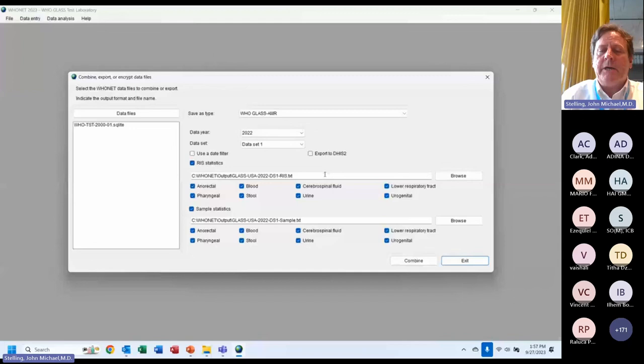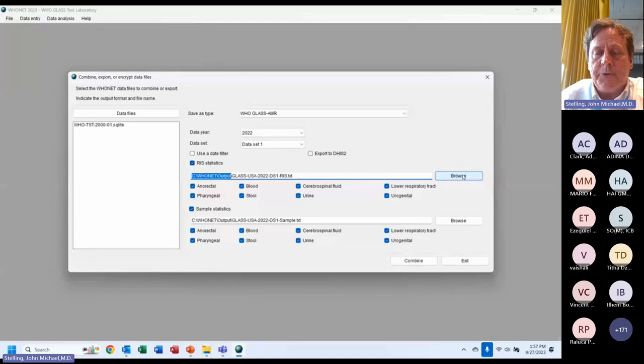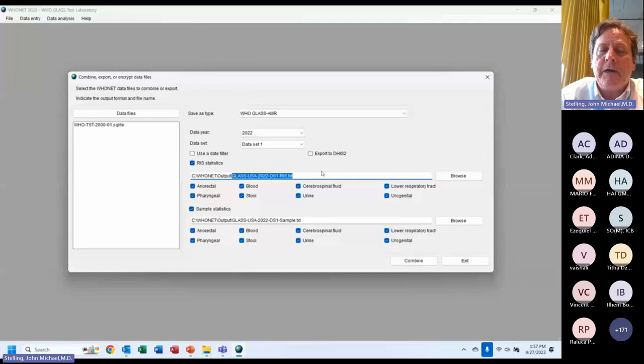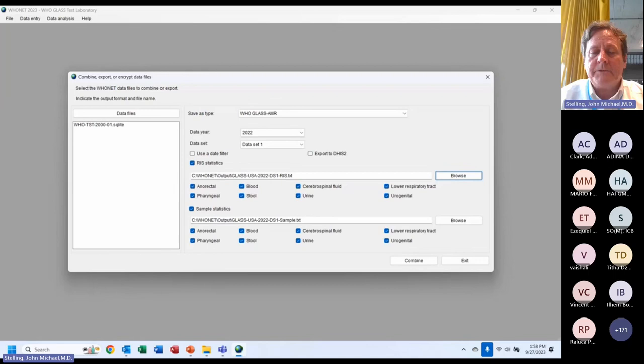We now have the two files. By default, WHO Net puts outputs into the WHO Net output folder, though you can browse to choose a different location. The name of the file is 'GLASS USA 2022 Dataset 1 RIS.' You can change the file name. Here in the output folder, you see the RIS file and the samples file. WHO Net has done its job — it has created a completely valid RIS file and a valid samples file. If I open the RIS file in Notepad, you can see the GLASS file structure with the antibiotic results.